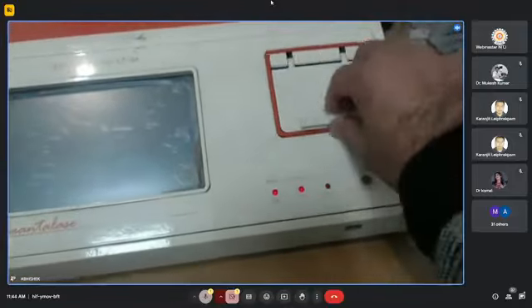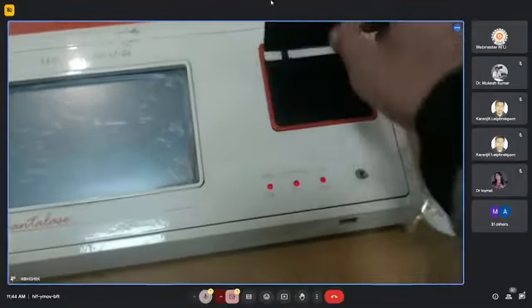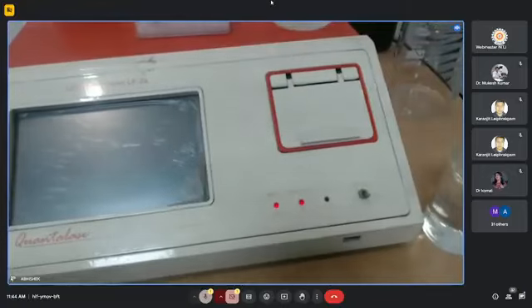So there is an anodized layer inside this chamber, and this absorption increases the background fluorescence several times, which affects the accuracy of the instrument. This can be avoided by taking suitable precautions while doing the measurements.